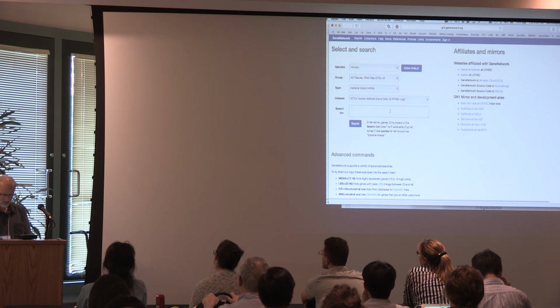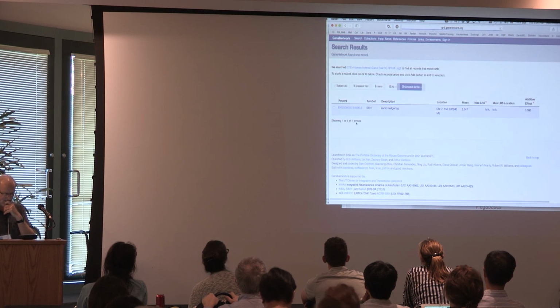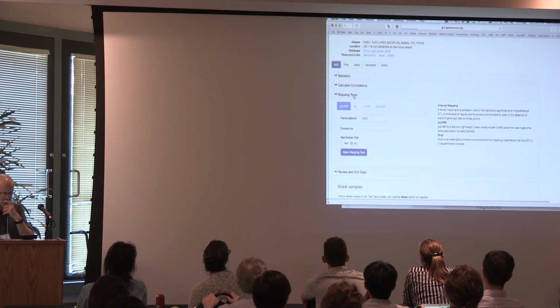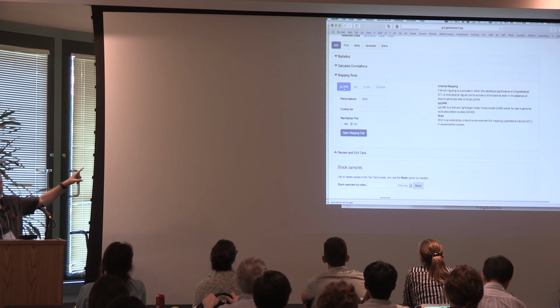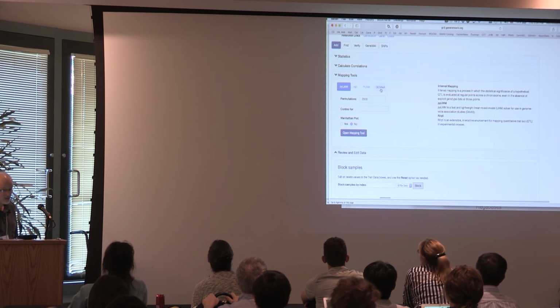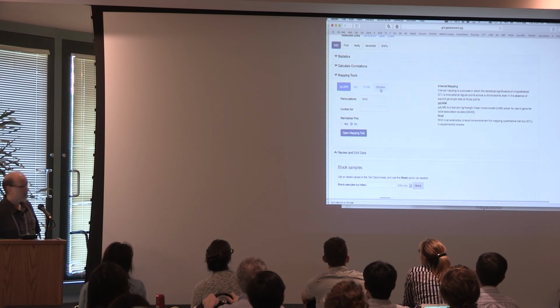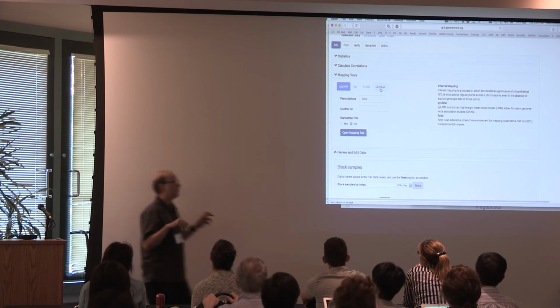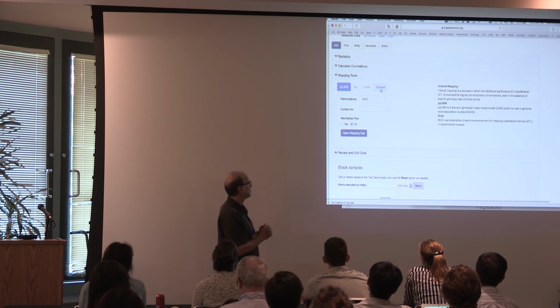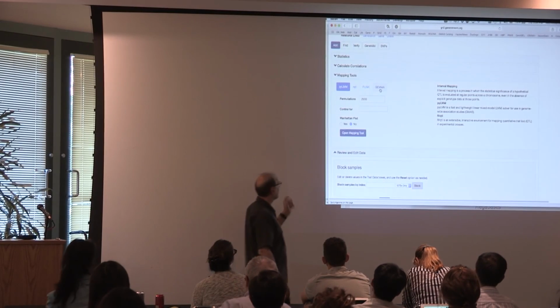Let's say I look at sonic hedgehog in adrenal gland, and I've selected it. Now the mapping tools here include this Python linear mixed model, R/qtl, PLINK, which is the common one, and then GEMMA, which also corrects for the kinship matrix. This is from Matt Stephens' group at the University of Chicago. So in GeneNetwork 2, we're adding much more sophisticated mapping tools, but the interface isn't as visual yet, but it'll do all of that stuff.